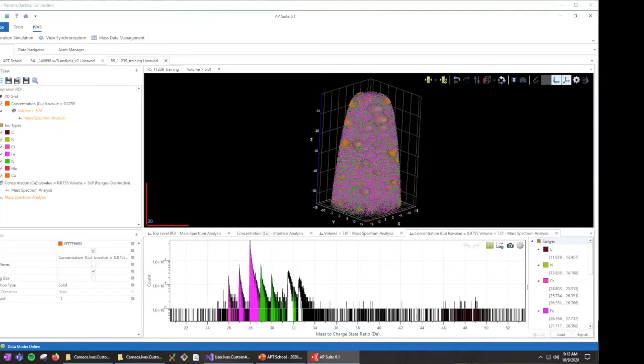So the containment test, just an explanation, I don't know if you've been here before, but this was exactly the discussion we had earlier today. In IVS, it's obviously identical to what we do in the Atom Probe toolbox. Okay, thank you for that. Yes, and Marcus is right, it's not exactly, there are other algorithms you can use for containment tests.